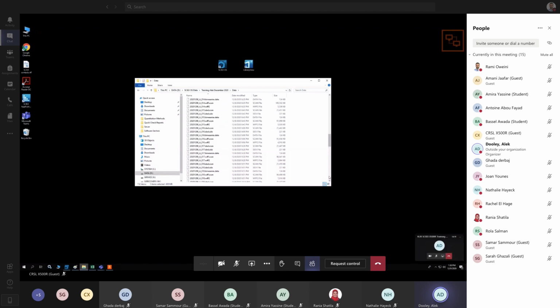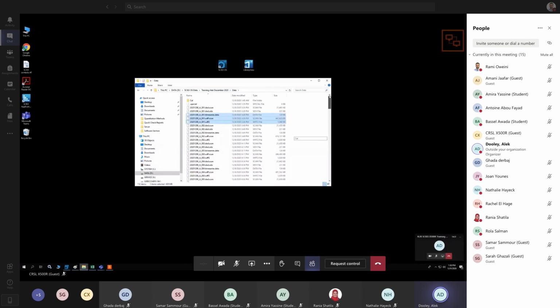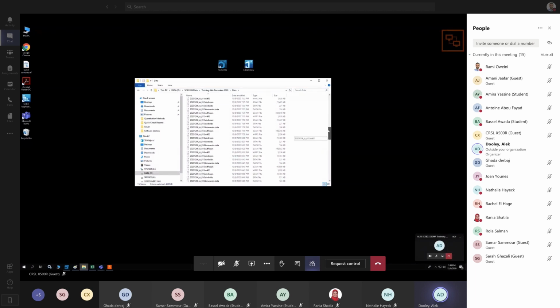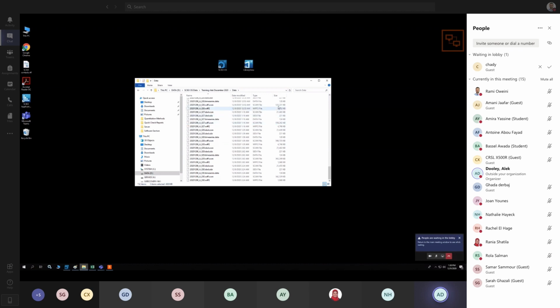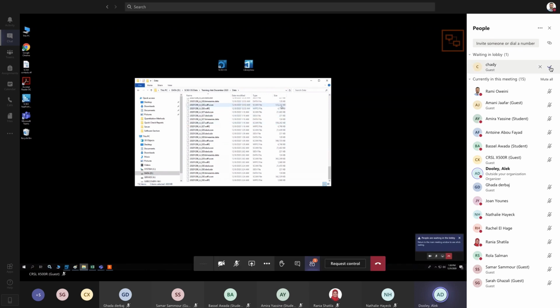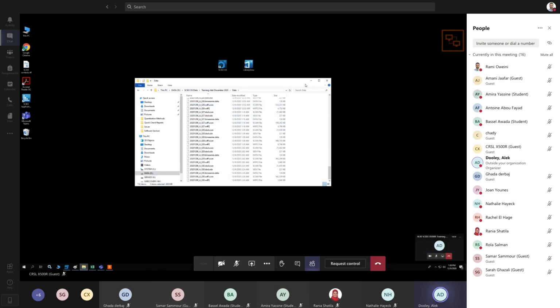And probably, actually, the first data files were the TOF, right? And then we did the IDA, and then we did the swath. I think that's how we set it up. So anyway, you're looking at about 500 megabytes per file. So just copy from here. That's easy, right?